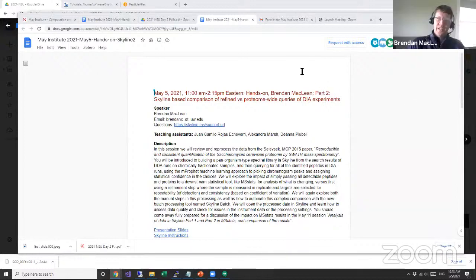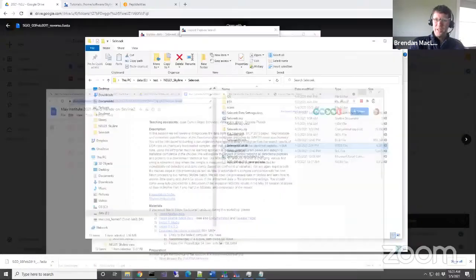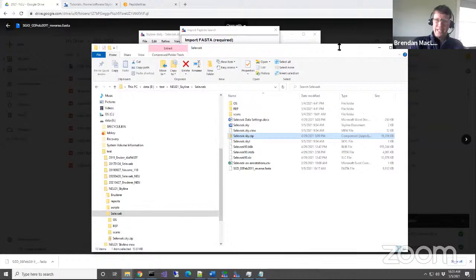So that's the Google Doc for today. It contains the presentation slides. The instructions are actually what we've just been working through, but we still have a way to go. So we have a few more things to do before our template is complete.